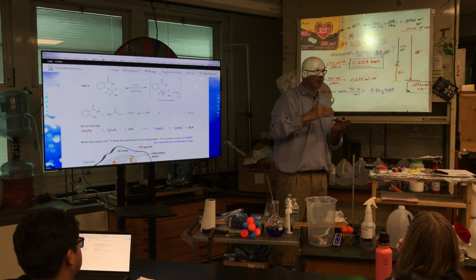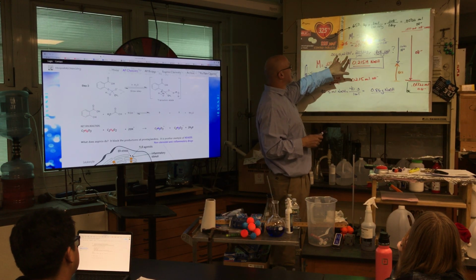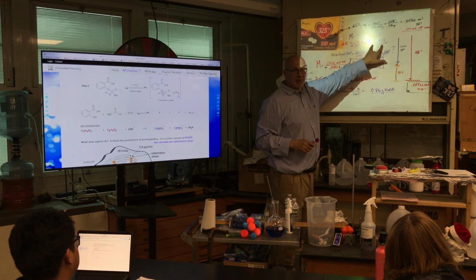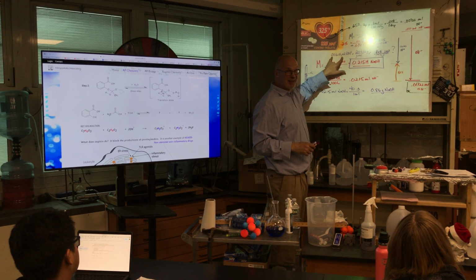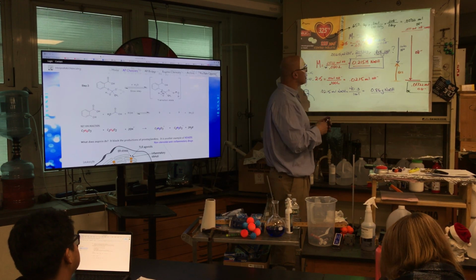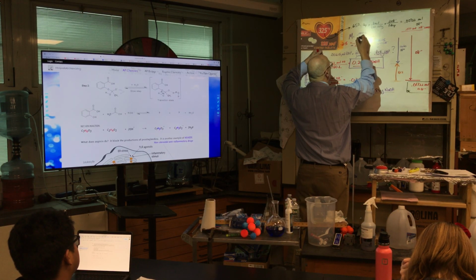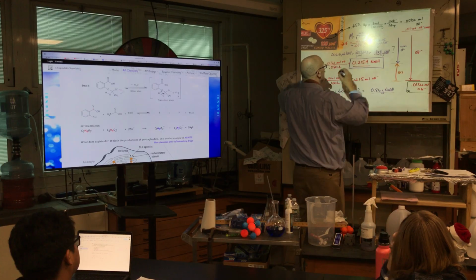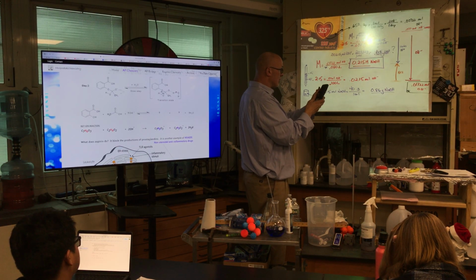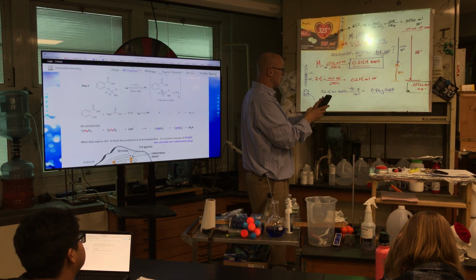the last lab? Okay. Now, the cool part is, don't we know exactly the moles of base we just delivered? Because it matches the KHP. So we neutralized the KHP at this exact moles, so that's the moles. 0.00215. Now I'm making up this number here. Let's go find the new molarity. It's going to be under. So 0.00215 divided by 0.0108.